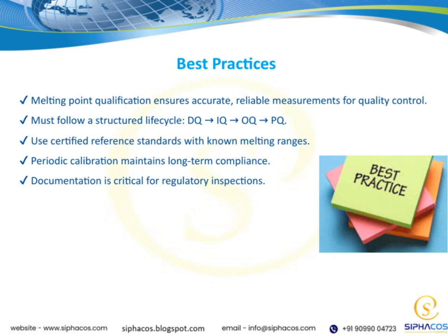Finally, thorough documentation can't be overstated. Keeping detailed records is critical because it supports regulatory inspections and demonstrates that we are following best practices and maintaining quality standards. By following these guidelines, we reinforce the integrity of our melting point testing process and uphold the highest quality standards across our operations.